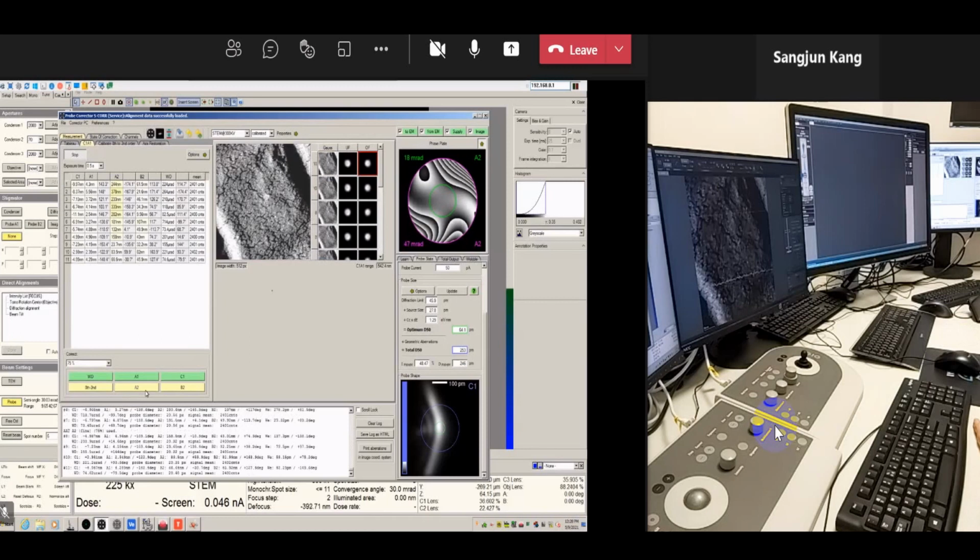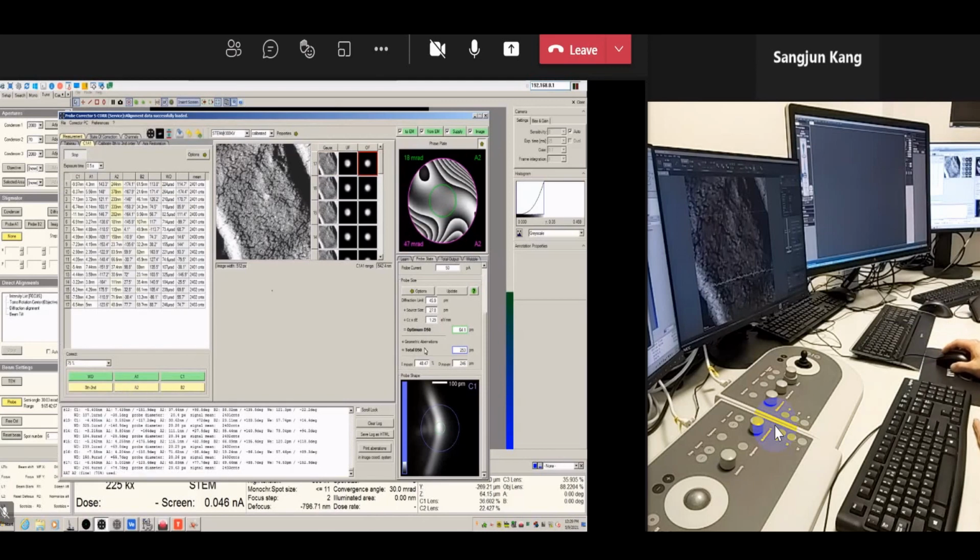So after probe correction, we'll get several images of the sample. That's all, actually. But I think it is quite good to have some troubles, so that once we meet some troubles, we can try to fix them. During that process, we really learn a lot. But today is too smooth. So A2 once more.